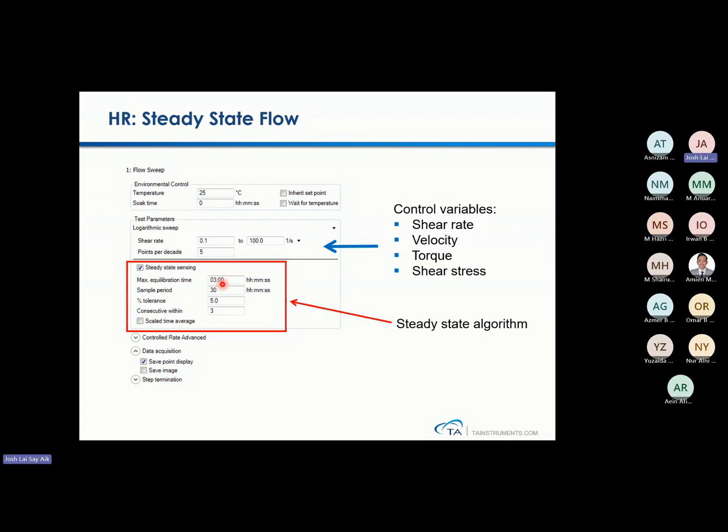Yeah. If you shorten this time, meaning it wouldn't care. Let's say I shorten it to 2 minutes, but up to this 2-minute period I still cannot reach this criteria that I set, then I will collect the points for. That's the effect. Oh, that's okay.